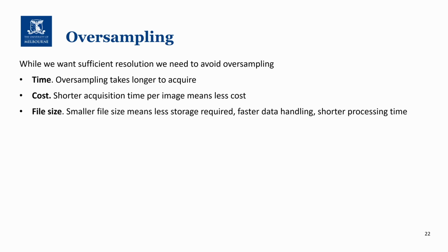Another important thing to consider is the file size. Smaller file sizes mean less storage is required. You can do faster data handling, and it will take a shorter time to process your data. These might seem minor, but they can all add up and become more time consuming or create a problem down the line. If you think your files might be too large, it could be time to review your settings.